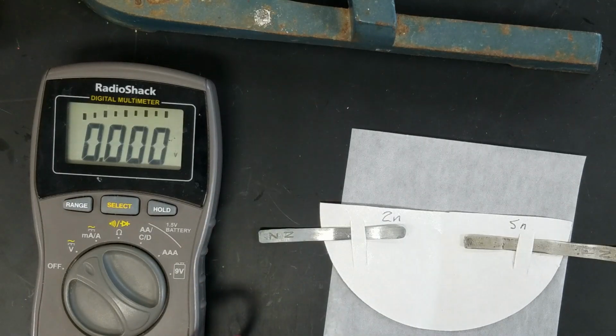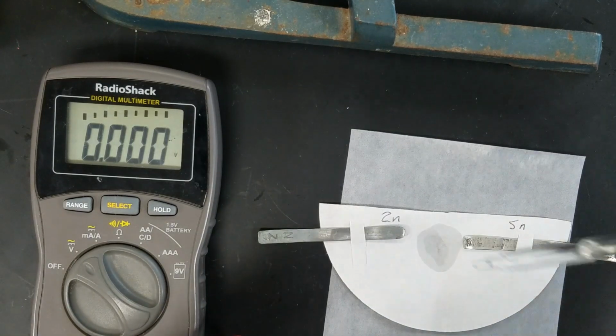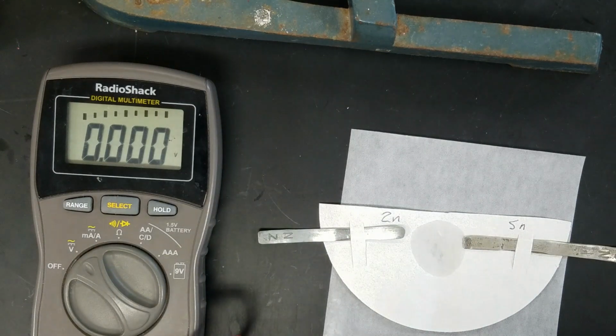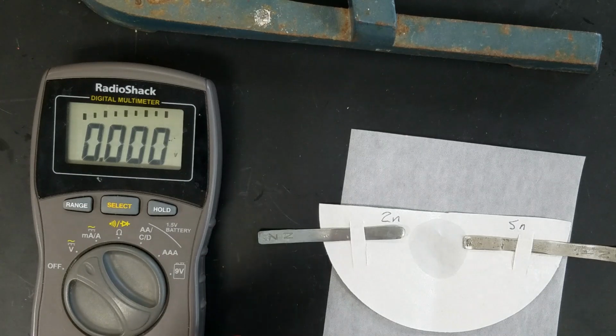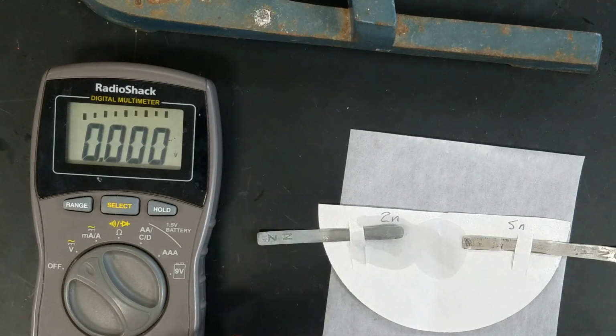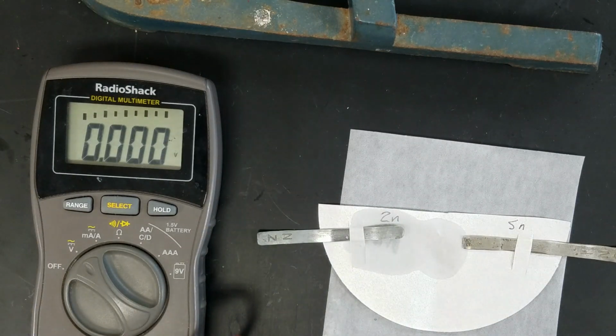Alright, we're now trying zinc versus tin. You may have noticed that our voltages jump around a little bit. That has to do with when we make a good connection or not. So what you want to record is the one that you see most frequently. We're going to add zinc solution to the zinc side of our cell, and tin to the tin side of our cell.